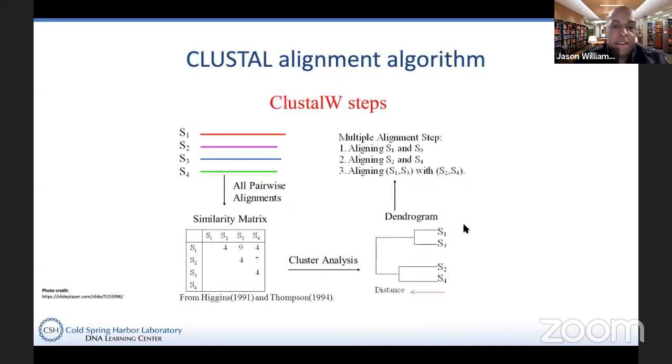So there is an algorithm. We're actually using muscle, but I thought I'd mention this one called Clustal. It's one of the first ones that really came out, by Des Higgins, who is at University College Dublin, and it was one of the first to do this type of alignment, multiple sequence alignment. And it's an algorithm, so there's a couple of steps to it.